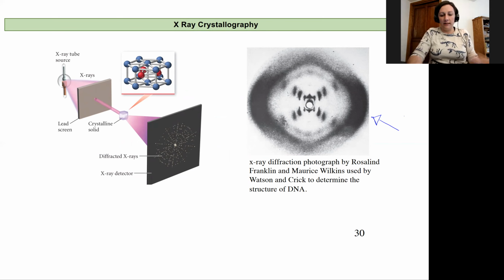So I know that looking at that blob, it's kind of intimidating to be like, oh yes, let's just pull out a complicated structure from it. And when you're actually doing this in the lab, you use programs to help crunch the math of determining what it is. But essentially what you're doing is you're taking an X-ray source, and that X-ray source is funneled through a pinhole, so that you have an X-ray laser essentially, and you aim it at a crystal.